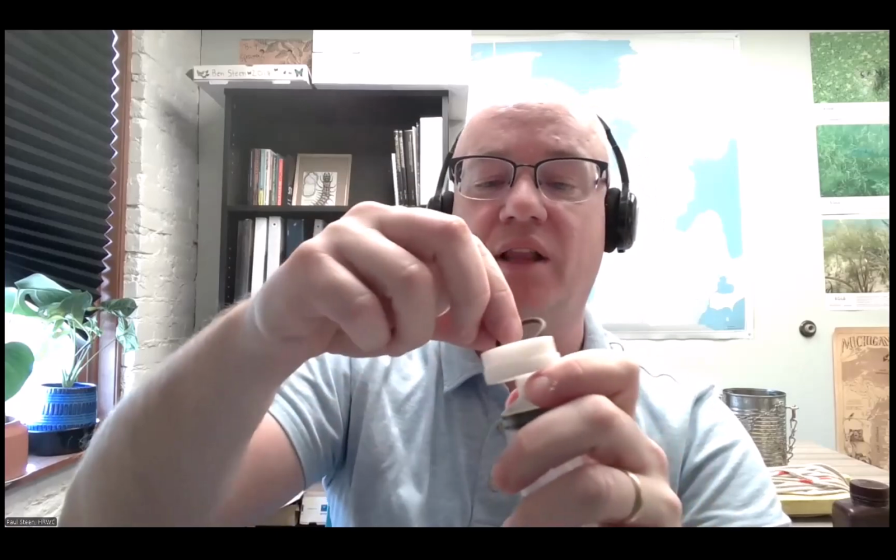So this is called the filter holder, and it unscrews. And in the filter holder, there'll be a little ring. So this is needed to prevent leaks. So be careful that you don't lose this. It may be kind of a clearish circle, or it may be brown like that. So just be warned that that's in there, and you don't want to lose it.